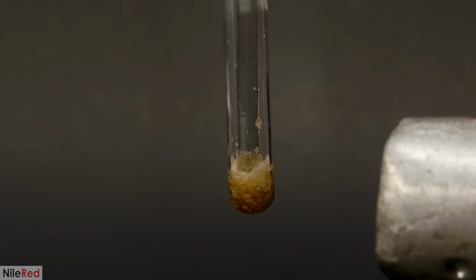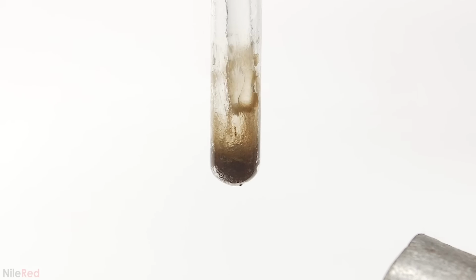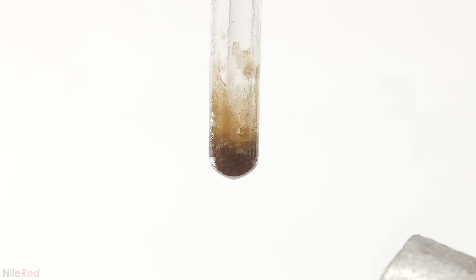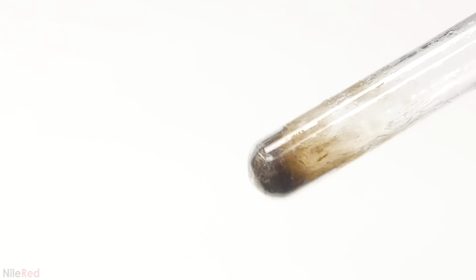The stuff I have here is already 20% triacetate, and I just want to see how it would turn out. After a couple minutes, it was a gooey blob at the bottom, and I think it's a mixture of liquefied diacetate and semi-solid triacetate. I let it cool down, and then I smashed the tube with a hammer and recovered the small piece of plastic.